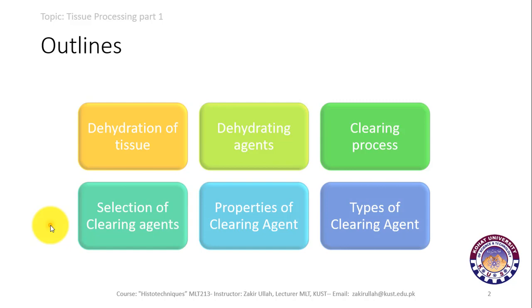In the last part, we will discuss the different types of clearing agents, their advantages and their disadvantages.